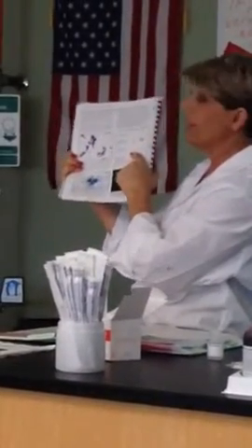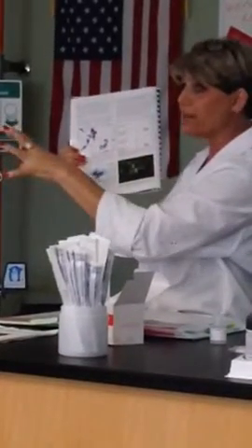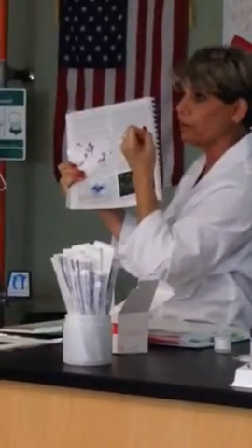Then, after decolorizing, this is what we call the determinative step. This is when the determination happens, this is the important step, this is when the differentiation happens. For bacteria that have waxes in their wall, that pink stain goes into the waxes and the waxes hold it. So they don't get decolorized, they stay pink. Cells that don't have the waxes are going to get decolorized because they don't have the waxes to hold on to the stain. So the color's going to leave, and they get decolorized back to clear.